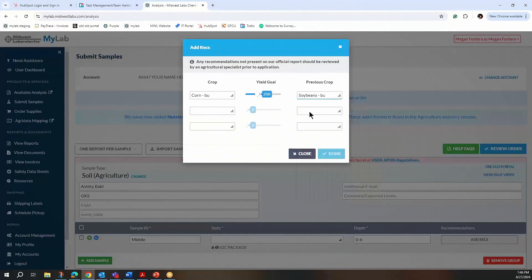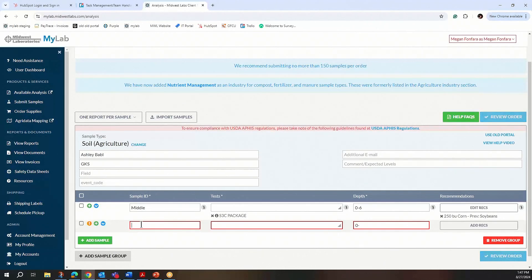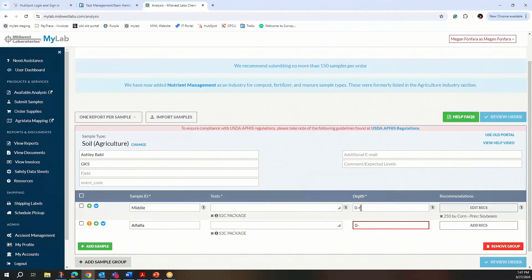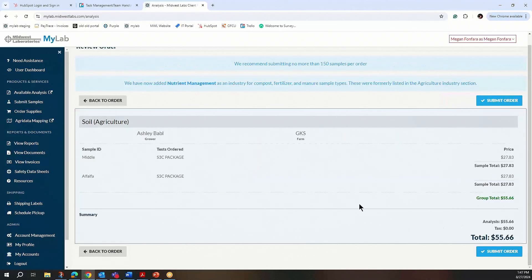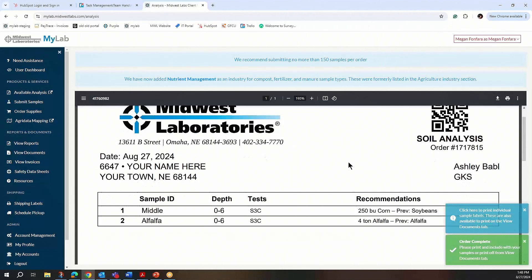Click Done, then the Add Sample button. The second sample was labeled Alfalfa. She also chose the same test package, the S3C. You can also use the arrows to the right of each field — they'll just populate down through the samples. For this second sample, she chose Alfalfa at yield goal 4, and the previous crop was also Alfalfa. She'll click Done. Once everything is all filled out and matches your samples, click the Review Order button. You'll get a summary of your testing, and if you need to make edits, you can click Back to Order or Submit Order. Once you click Submit, you'll need to print off the page that has the QR code in the top right, logo on the left, and our address where you are dropping off samples. This will get printed off and brought in with her samples.